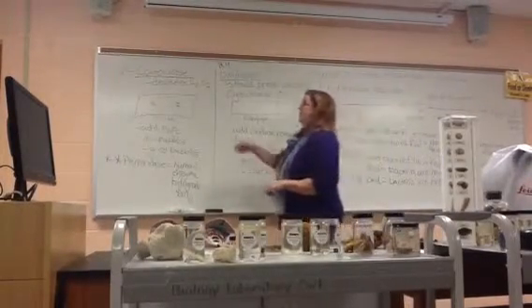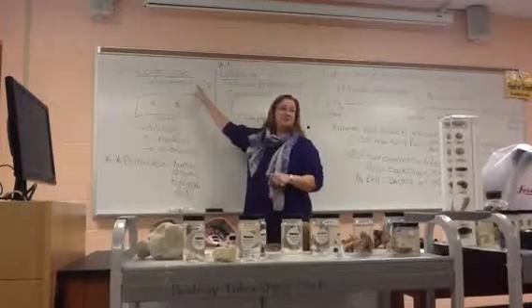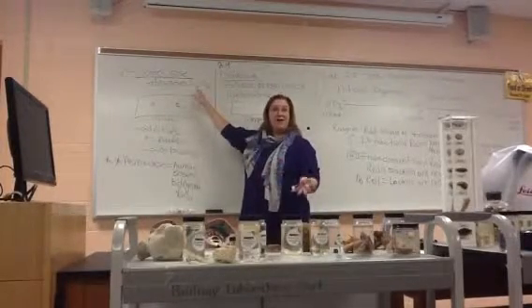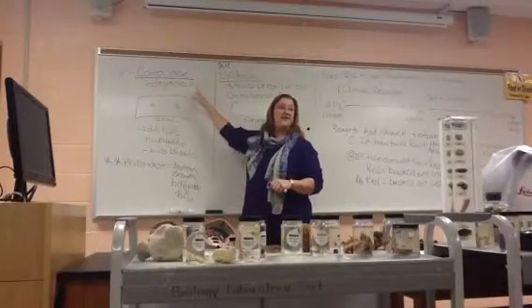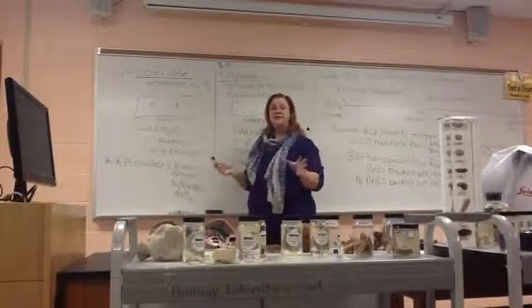Now, not all bacteria can make catalase, right? Just like every other test we've done, some bacteria are going to be positive, some are going to be negative. That's what we're trying to find out. Do they produce catalase or not? So this is a real easy test to do.